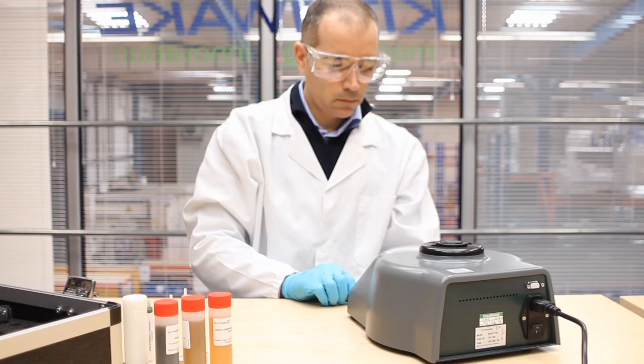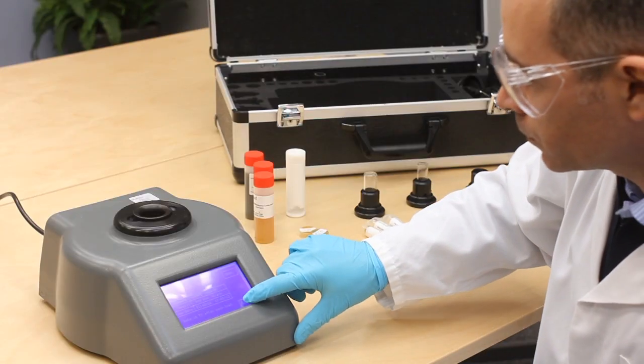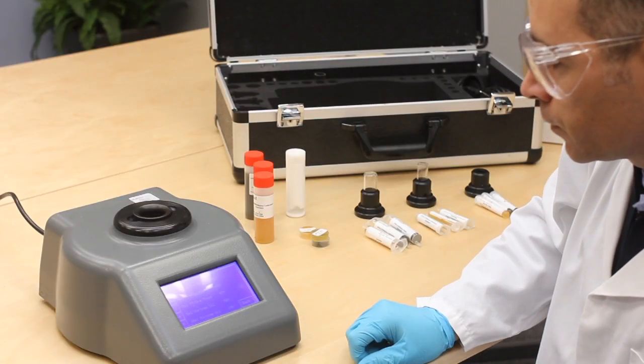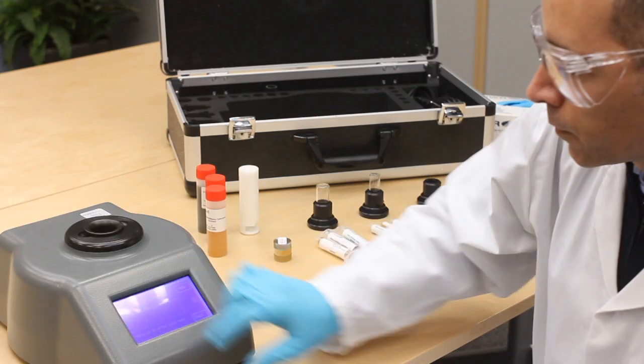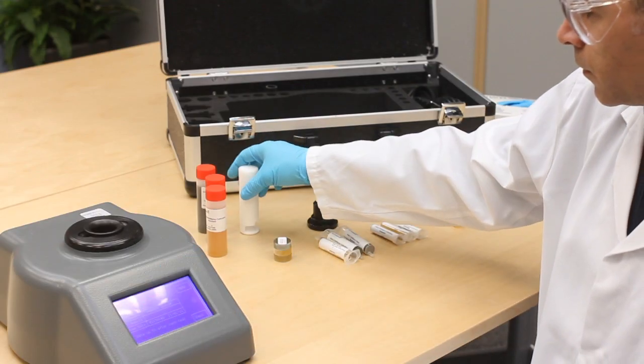The Kittiwake Analects FDM Plus is a highly accurate instrument designed to measure wear metal particle contamination of both oil and grease samples in a rugged, field-deployable unit.